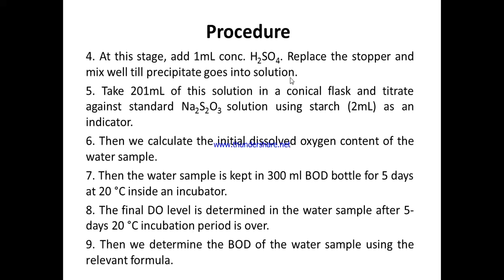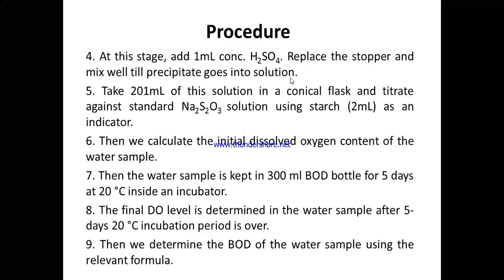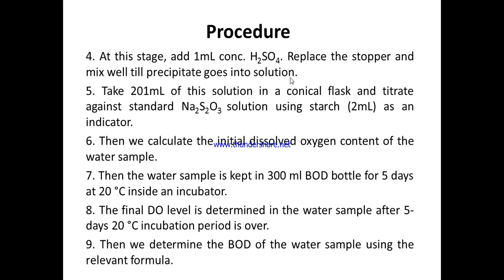सोडियम थायोसल्फेट सोल्यूशन जो है 0.025 नॉर्मेलिटी का है, that we add in the burette and we titrate the BOD sample taken in the flask, okay, where starch was added as an indicator. We will titrate it against the standard sodium thiosulfate solution in the burette. So initially what is the color of the sample in the conical flask? It is either blue in color or bluish green in color.